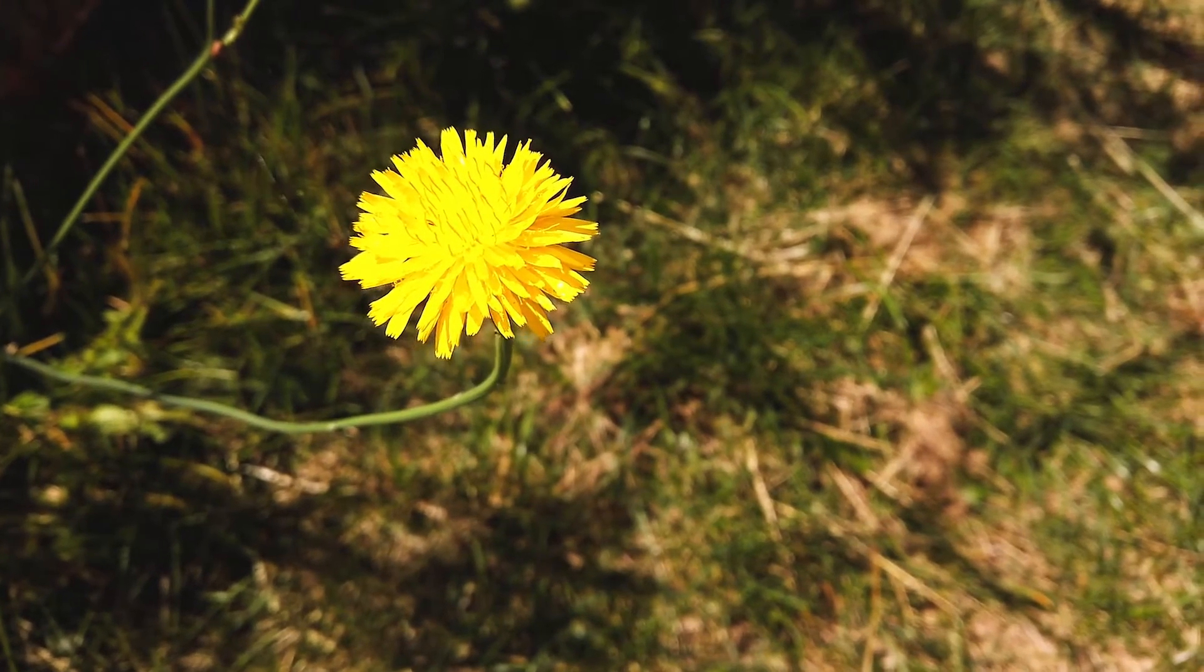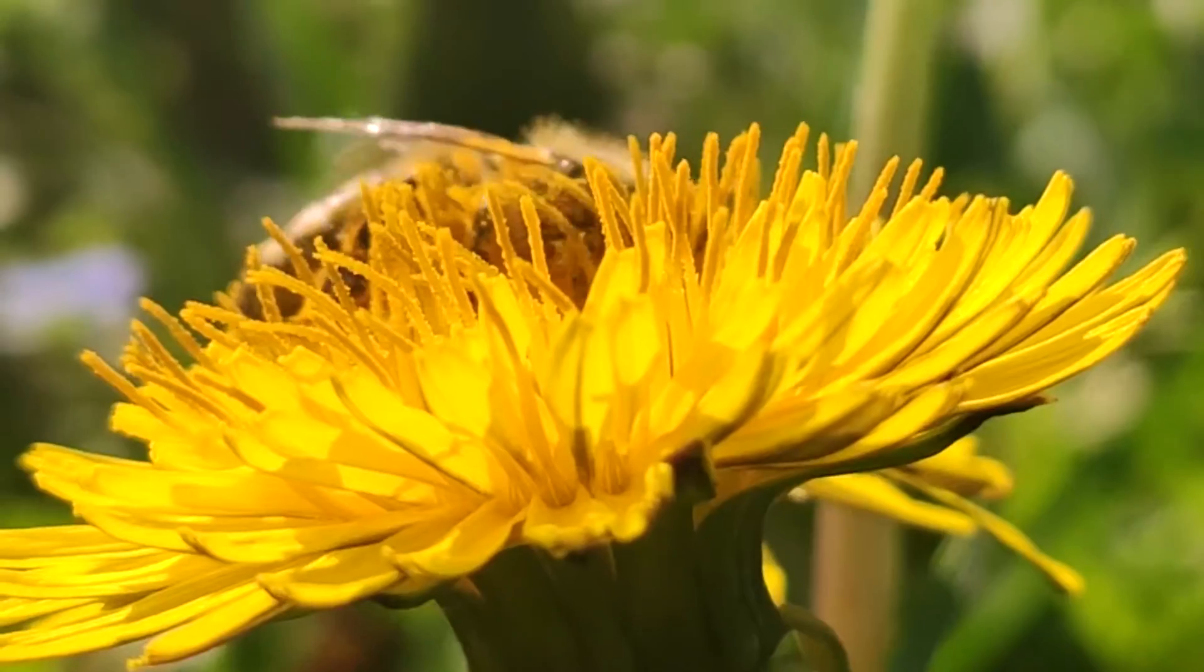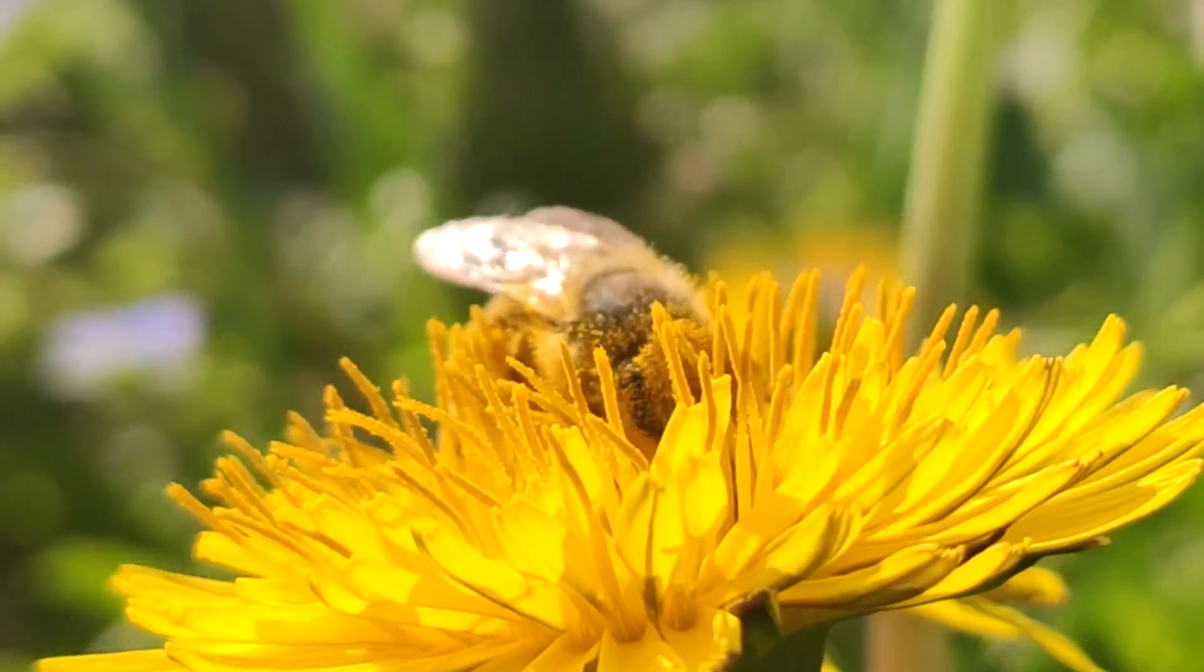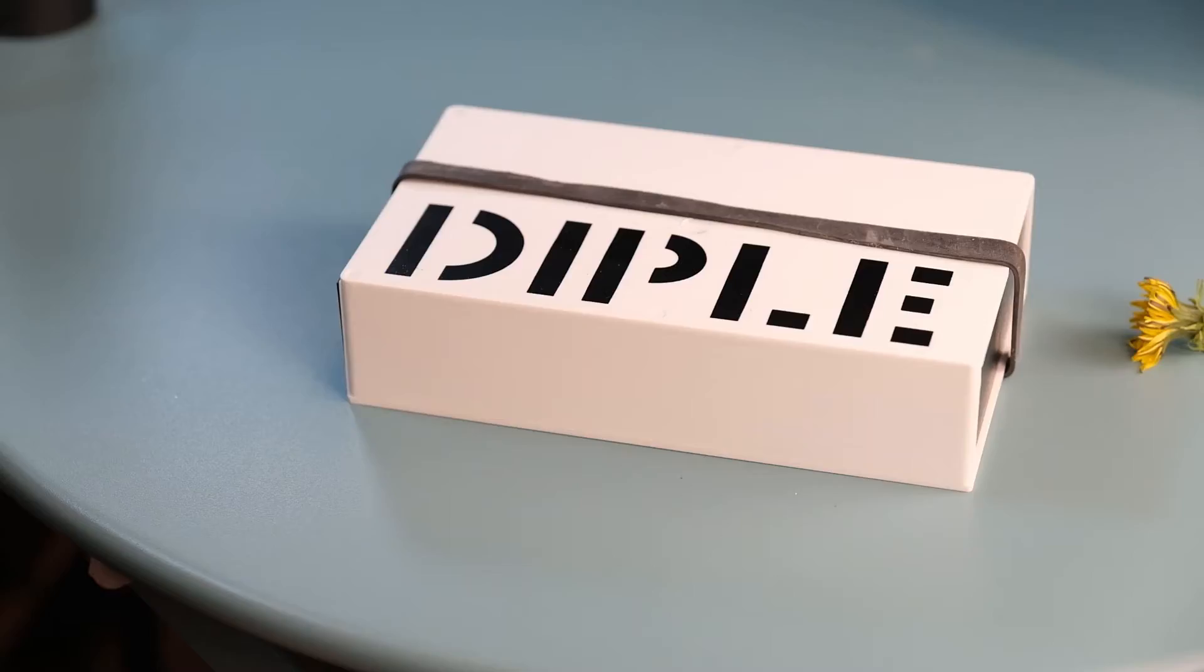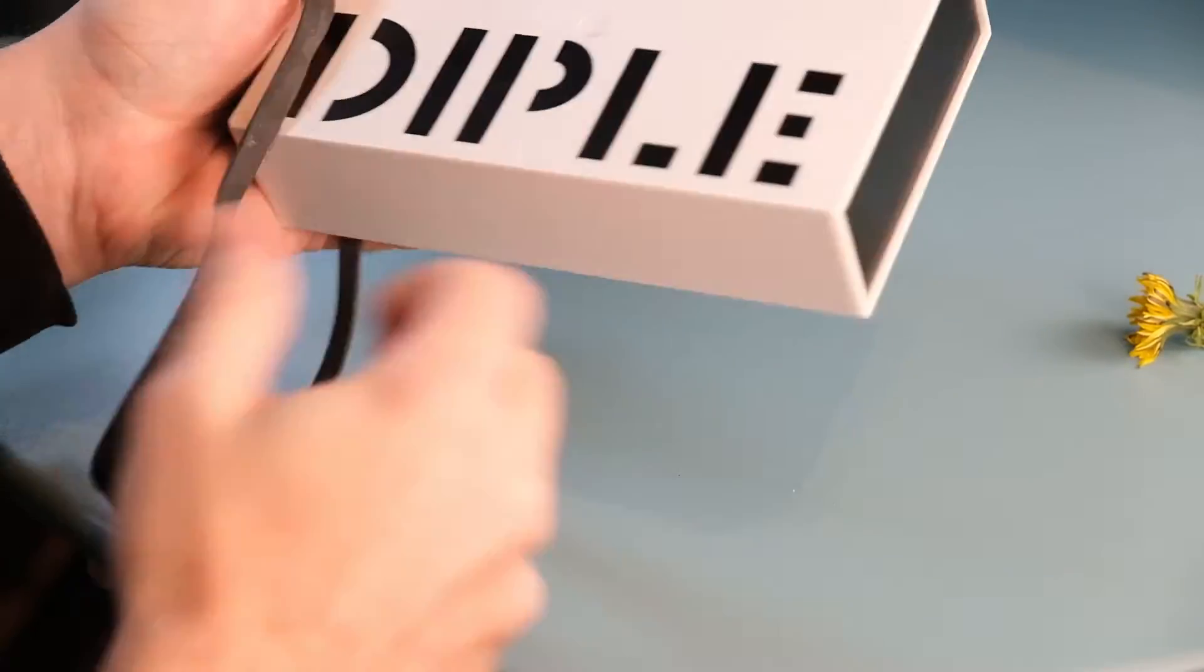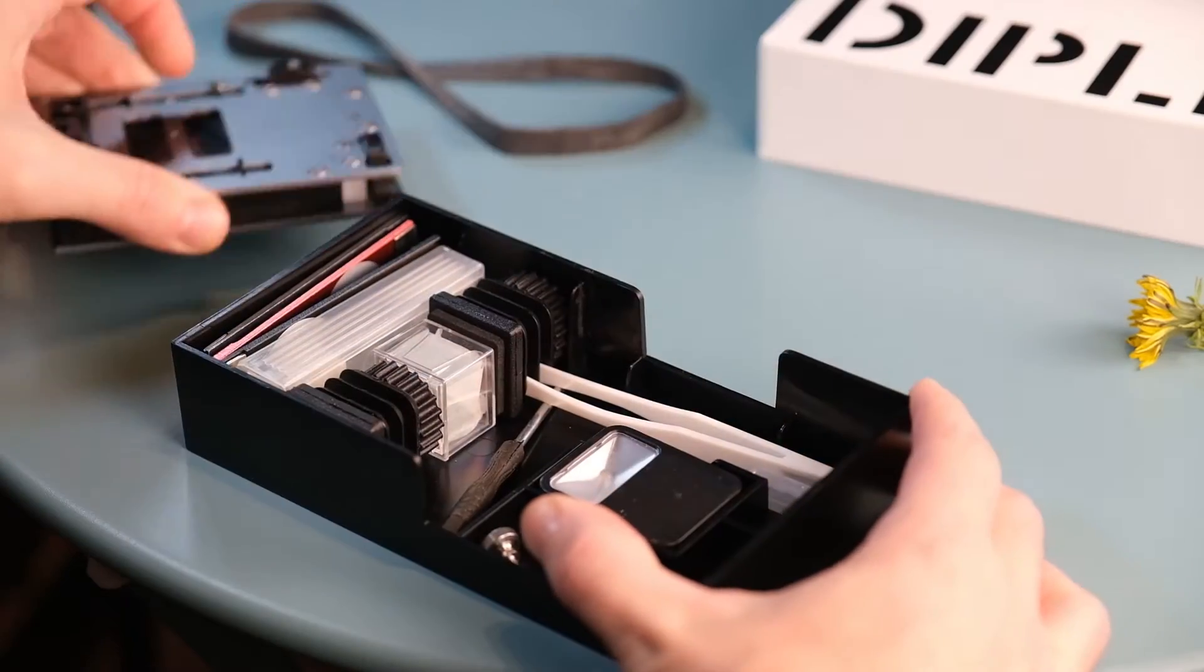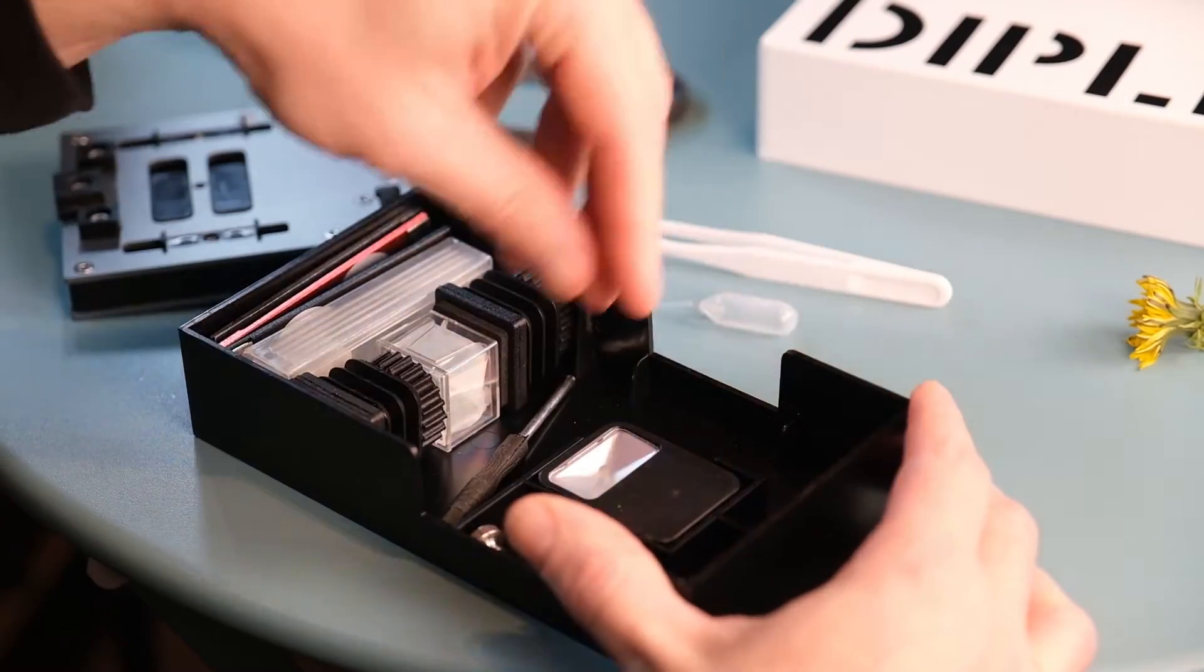Dandelions are very common flowers in our lawns and very interesting to observe closely. A lens is enough to distinguish the stamens and internal structures of the flower, but if we get even closer we can observe the individual pollen grains.